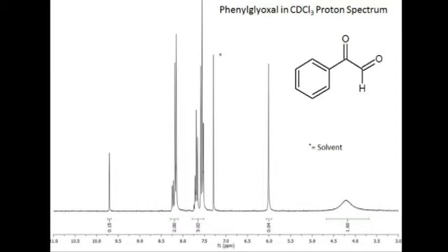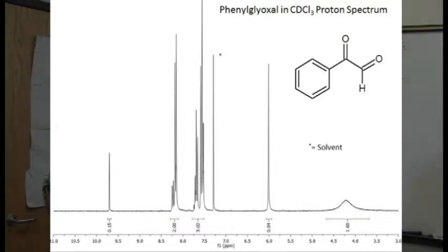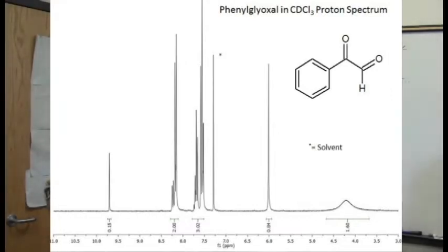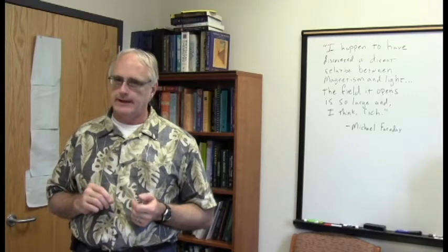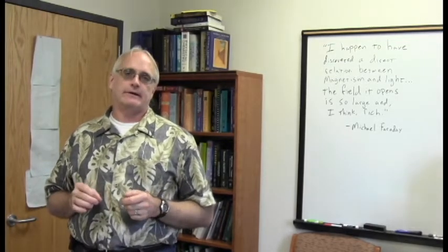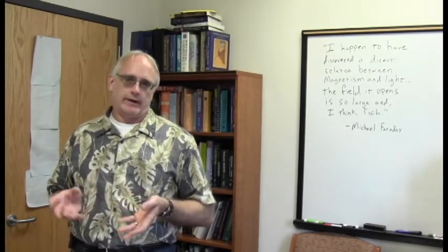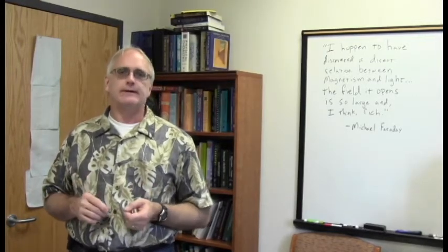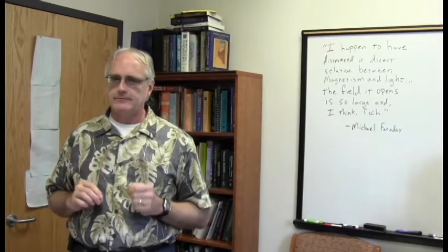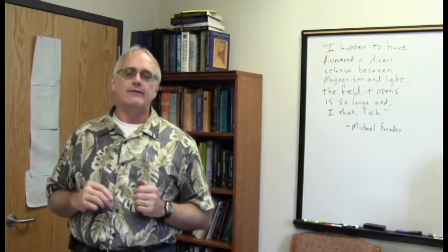Now the broad one, that's consistent with water. This sample seems to be fairly wet. Hey, it happens, so that's not a big surprise. But 6 ppm, that's unexpected, and it was a little bit hard to figure out what that might be. It's certainly not an aldehyde peak. My first thought when I looked at that peak at 6 ppm was that maybe this sample is contaminated. It has some water in it, so maybe it has the contaminant. But it's a big contaminant, and in fact, what bothered me about it is it is the one that integrates 1 to 5 with the aromatic.